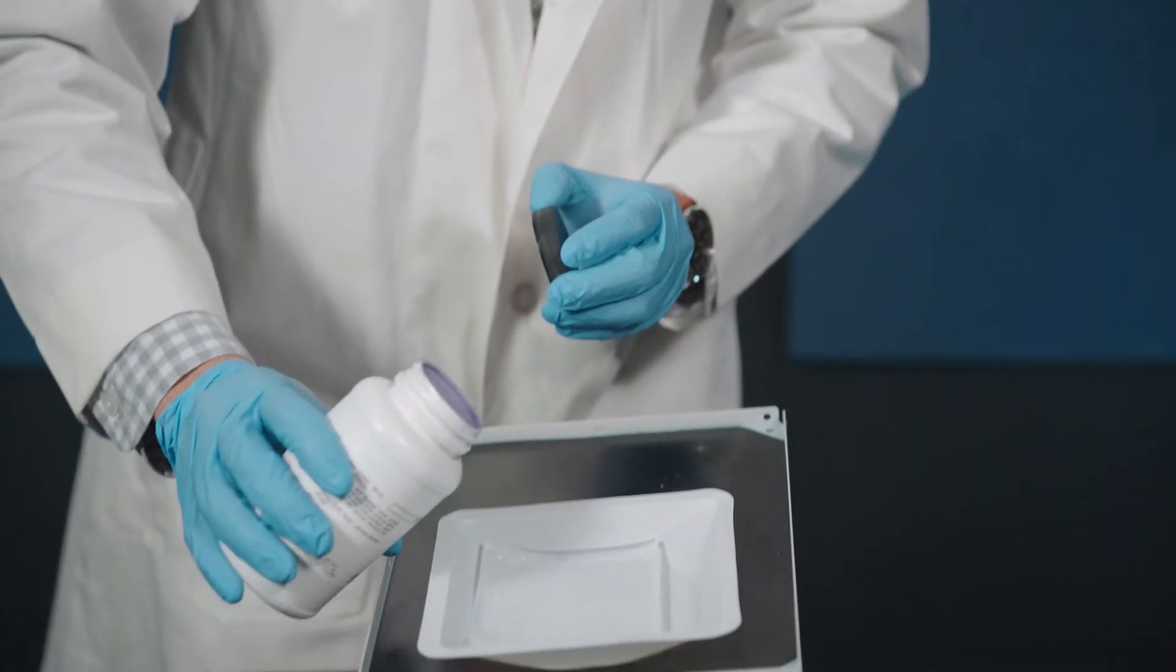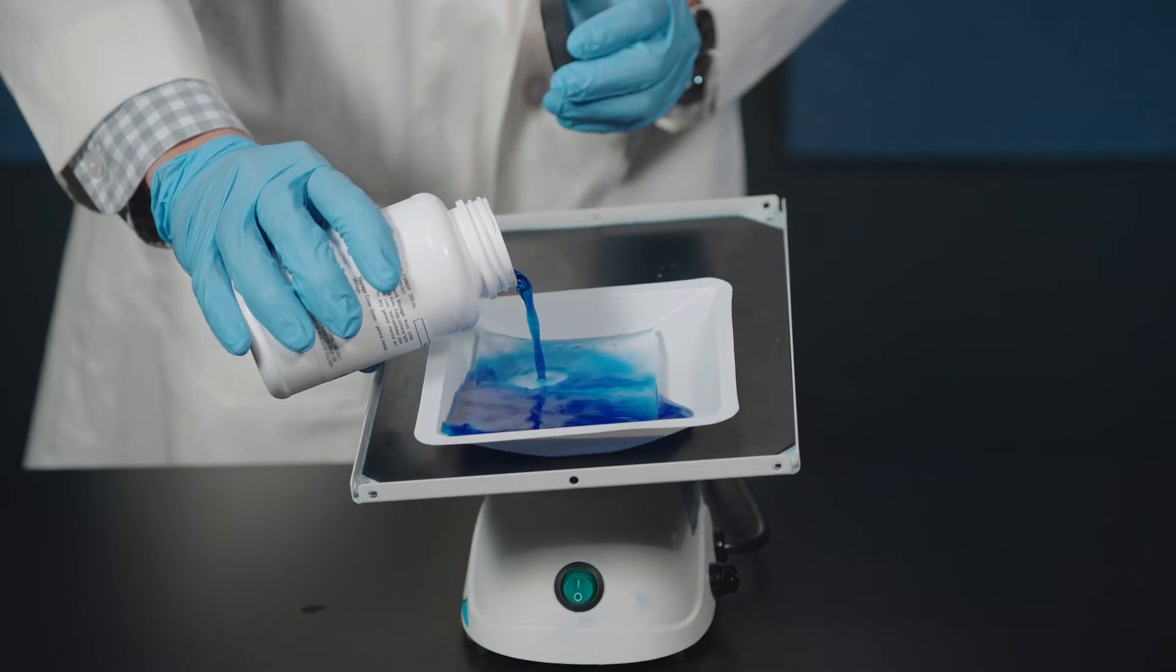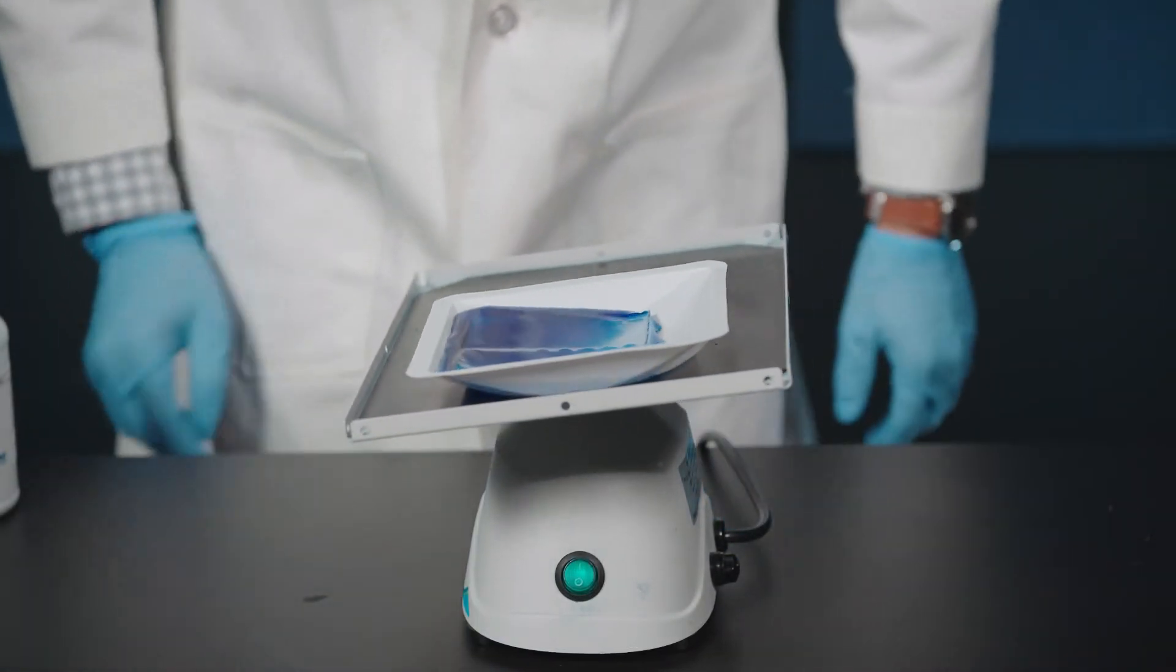Place the tray onto a benchtop rocker and carefully pour the Carolina Blue stain to cover the surface area of the gel. Let sit for 20 to 30 minutes while rocking.